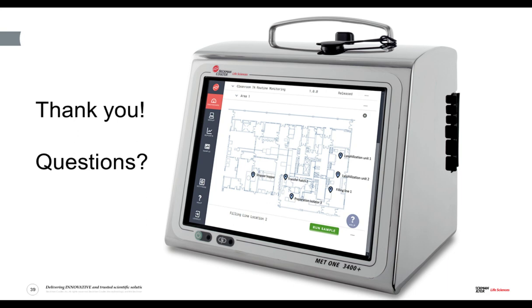That's a good question, thank you. And as I mentioned, I think a couple of times in the presentation, the counter actually uses Microsoft Active Directory to control username and password credentials. So when somebody logs on to the counter using their Active Directory credentials, the counter goes across their corporate network and verifies that the credentials they've used match the Active Directory on the network, and then assigns the username to the electronic record.